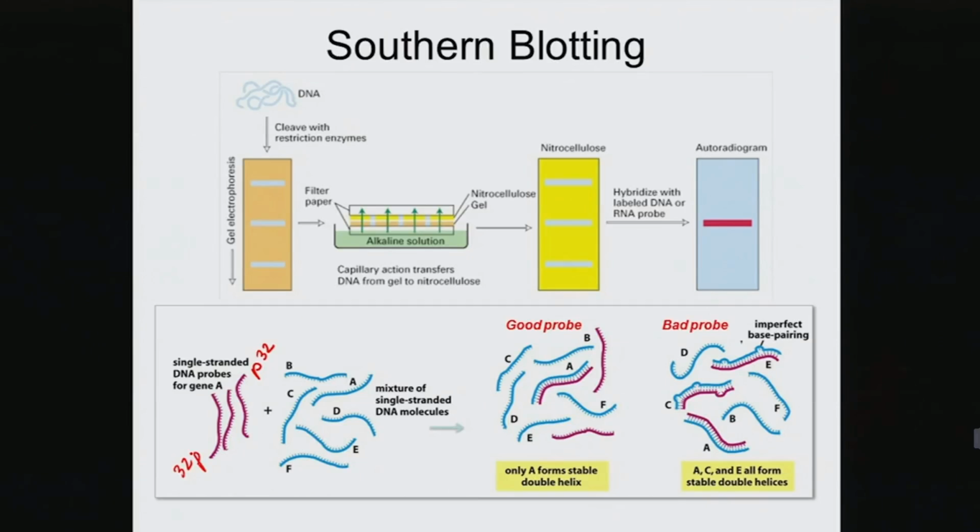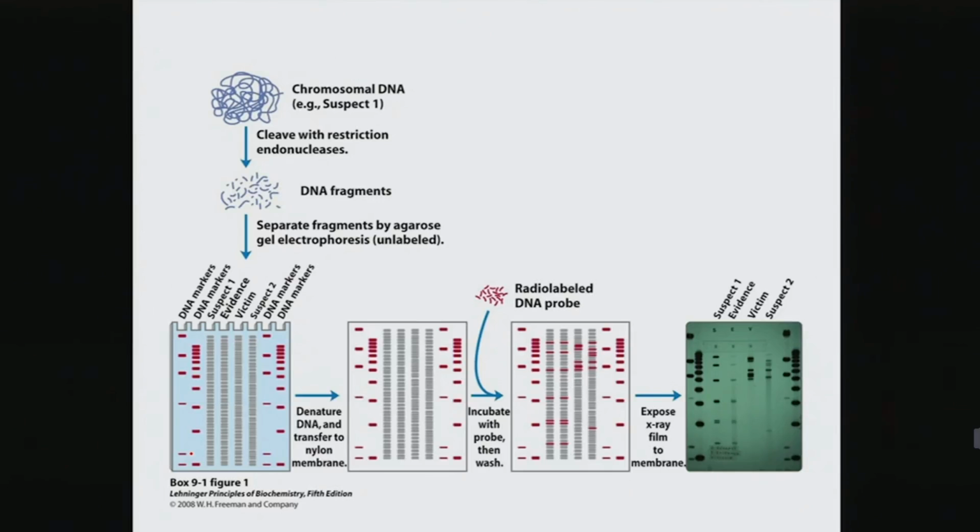Okay, so you can synthesize these types of probes, short stretches of DNA that you can radioactively label, and then take the step further. Instead of using a gel, transfer your fragments onto a nitrocellulose membrane, and then detect complementarity using autoradiograms. Okay, so you can use this synthetic DNA process to generate these types of probes. And that's really great because you can take it a step further and use this technique to identify fragments amongst different DNA samples. And again, same type of procedure.